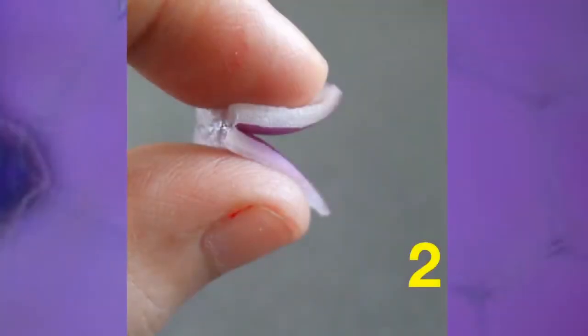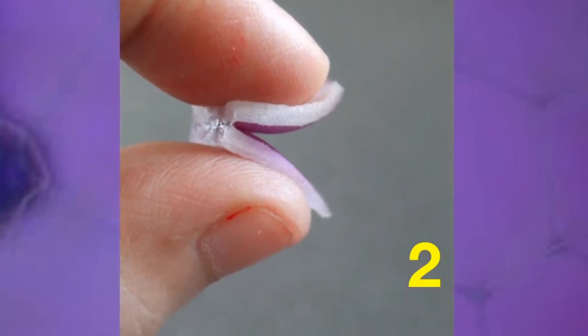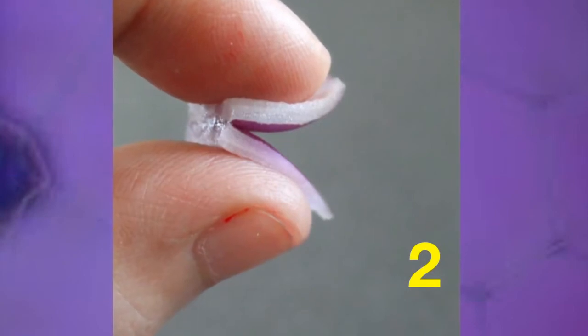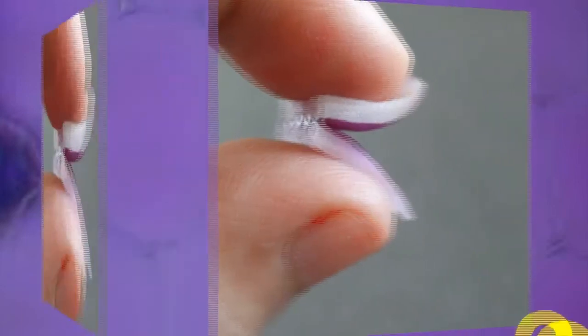If the layer cannot be peeled easily with the forceps, then fold the onion piece with the red cell surface facing towards you and fold it by pressing with the fingers. The white tissue will be broken, but the red tissue layer will remain intact. Remove the peel of the white tissue with the forceps and a thin film of the red cells will remain.